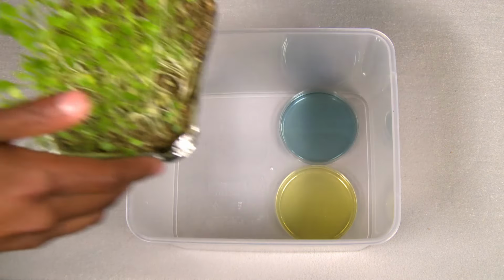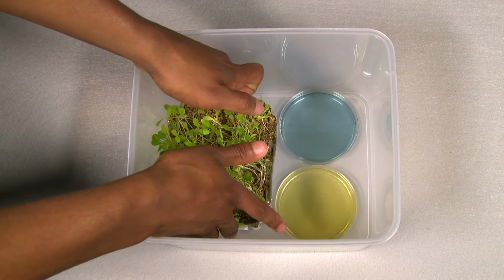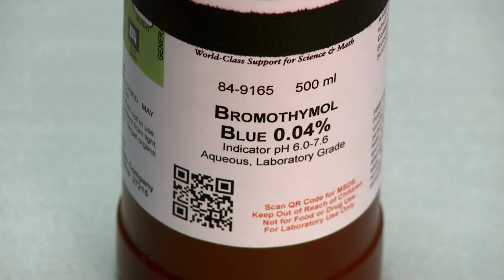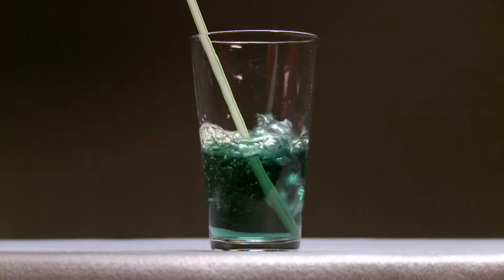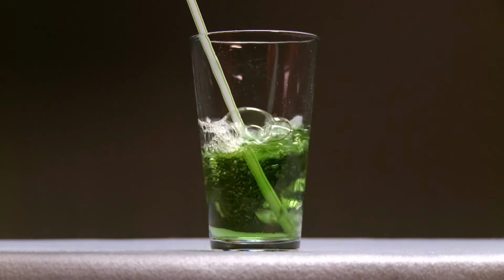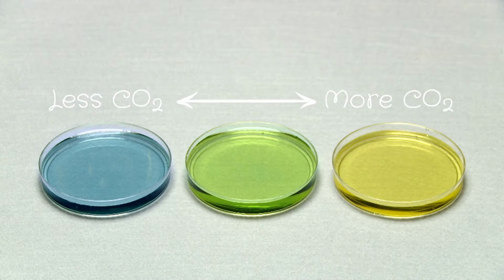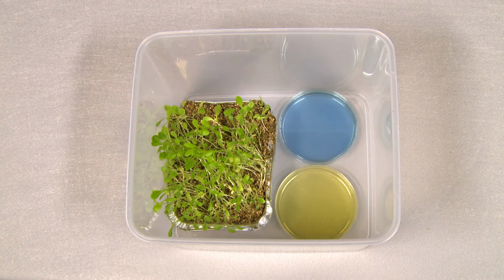To set up our light and dark investigation, we'll start with both yellow and blue BTB, and some plants. BTB is bromothymol blue. BTB changes color when carbon dioxide is added, like when you blow bubbles into it. We can use BTB to see if the carbon dioxide concentrations increase in the air. We'll have BTB in a container with the plants. These investigations will each take about 24 hours.